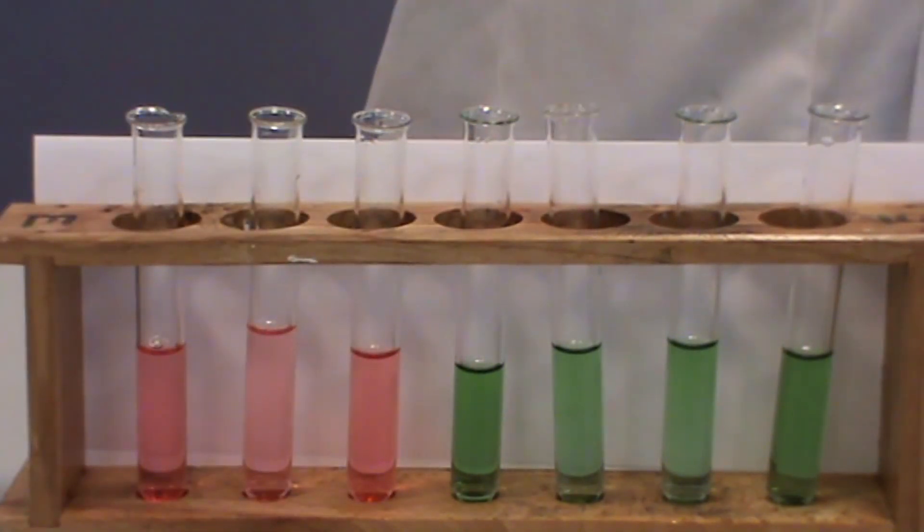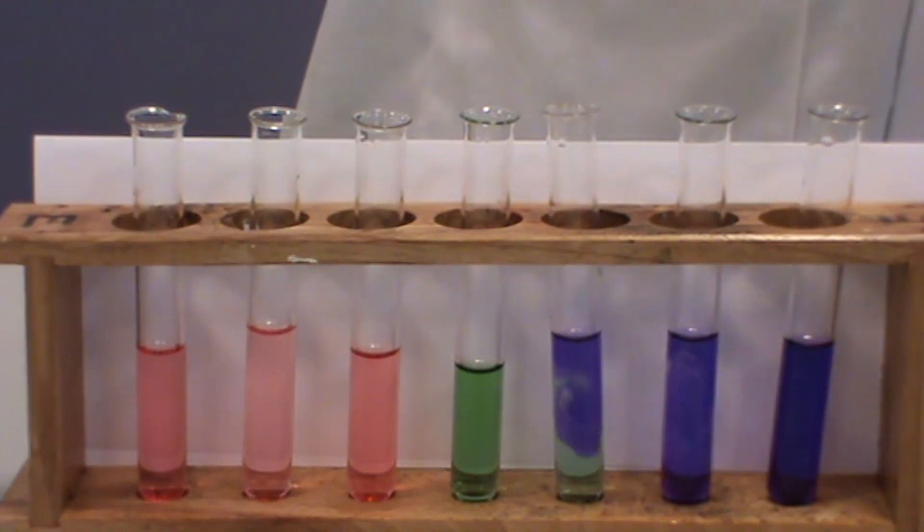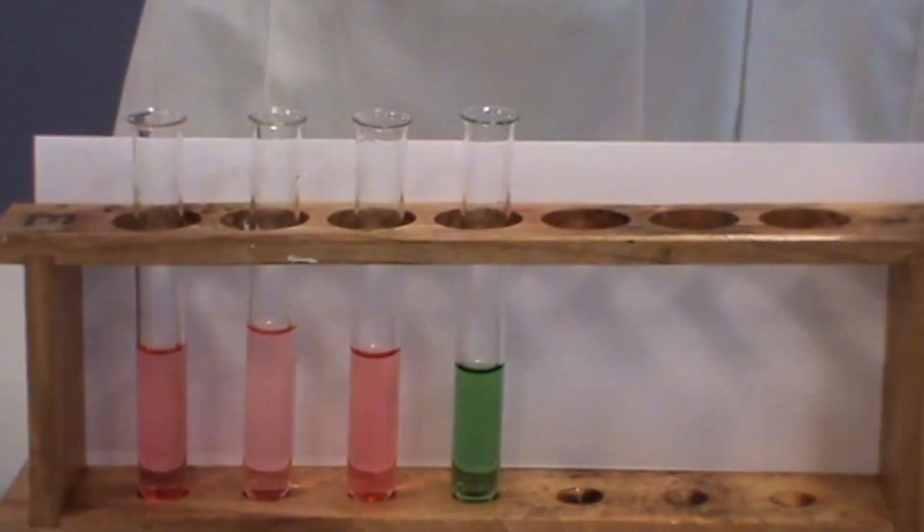Several drops of sodium hydroxide are added to another three of the test tubes. These are then also shaken up to produce a purple colour, indicating the solutions are very alkaline.